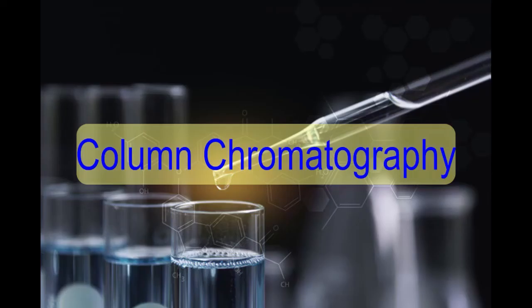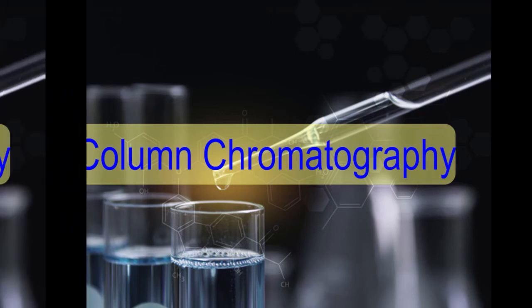We'll discuss column chromatography. Column chromatography is a technique which is used to separate a single chemical compound from a mixture dissolved in a fluid. It separates substances based on differential adsorption of compounds to the adsorbent, as the compounds move through the column at different rates, which allows them to get separated in fractions.